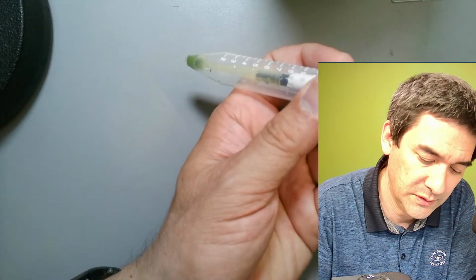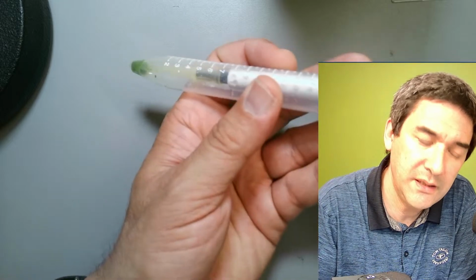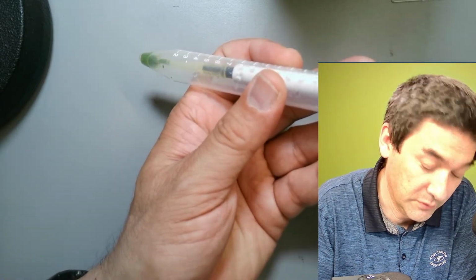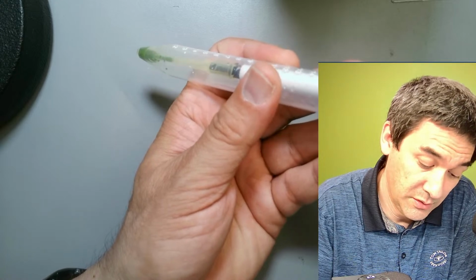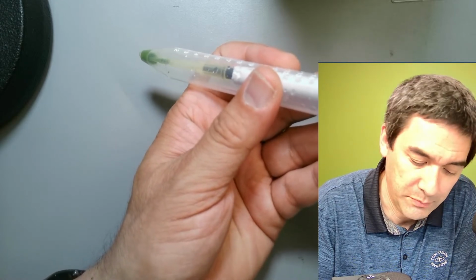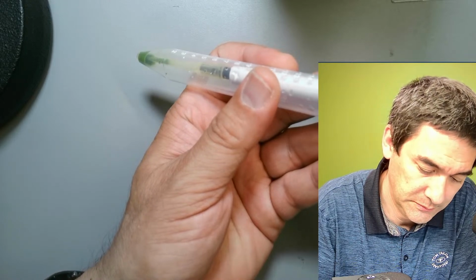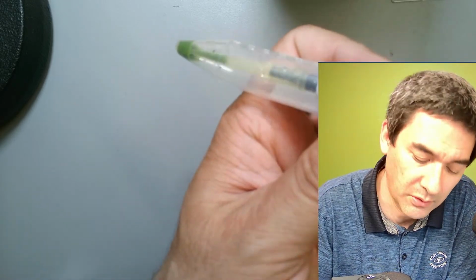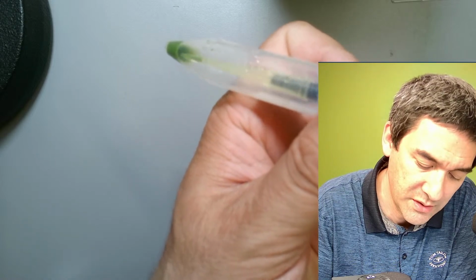This is very concentrated stuff here, okay? I've centrifuged this for about maybe 10 minutes or so. I resuspended it. You see it's a significantly dark, very dark green, so it's quite concentrated.